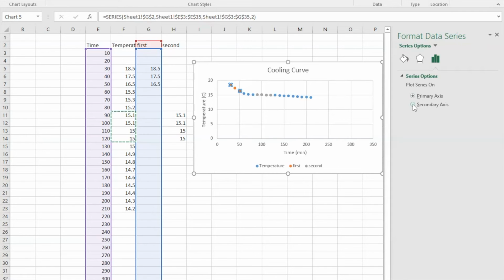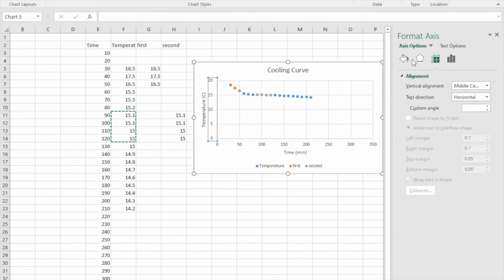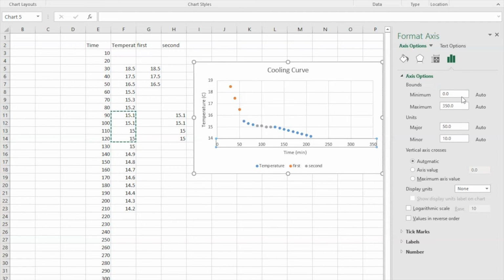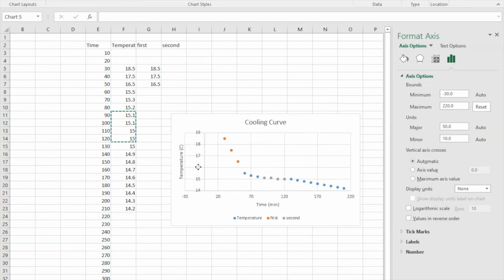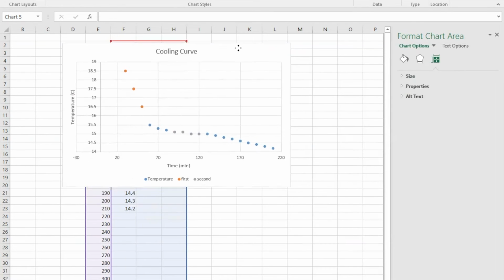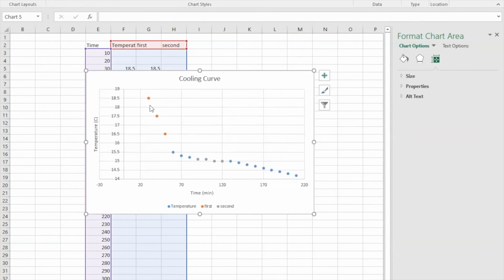So what you want to do is do a curve fit on the orange here. Well, first let's fix the labels here. Remember how the bounds weren't really good, so we want to go from about 14 to 20, right? And then for the other axis, we decided we wanted to go to a maximum of about 220 or so. Okay. All right. Now we're ready. So I'll put that right here. Perhaps we can, yeah, see that a little better, okay?